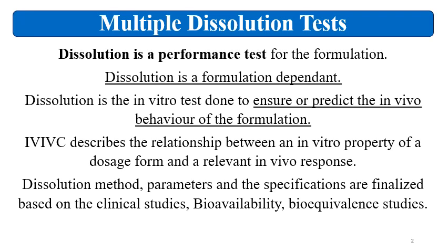The dissolution is a formulation dependent test. It is not like assay or impurity testing. It is very specific to the formulation. For example, you are making a formulation of, let's say, XYZ API. So assay limit will be more or less similar for all the formulations of that API, but dissolution test will vary.